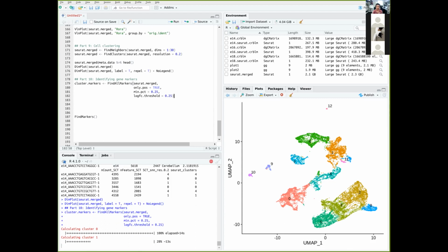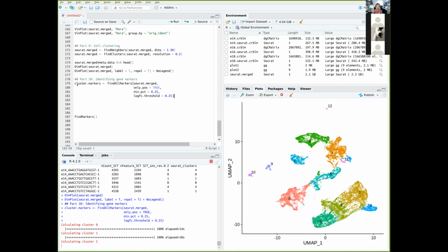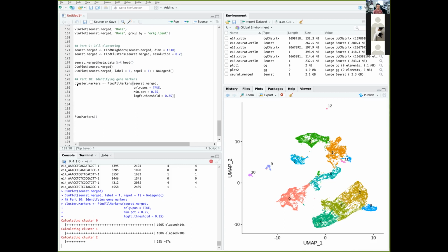If you are dealing with or trying to identify gene markers, do look through the data frame clustered up markers and plot out the values on your own. Basically, ask yourself whether the threshold or the filters that you use are good enough to separate your markers.